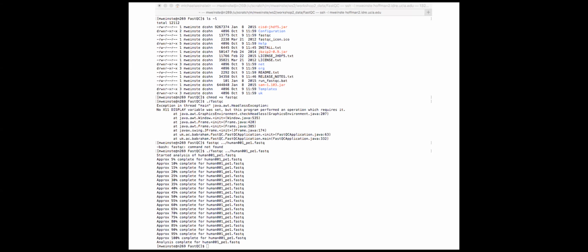All right, so everybody should be back on my slides. Once you get onto the Hoffman cluster, you should be connecting directly to your Scratch folder. Navigate down into workshop, navigate into WS2 and then workshop2_data, where we've been doing all of our work. And you should be able to see the file we just created. The file we just created ends in .html. So it'll probably have an icon next to it that looks like Google Chrome or Firefox or whatever browser you're using. If it has an icon next to it that looks like Internet Explorer, get a better browser.